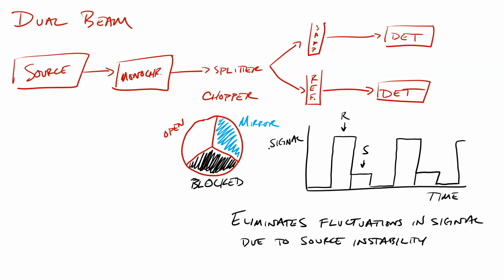Right? I'll put down here in parentheses power to remind you of that. Okay. The dual beam actually, because it has this blackout region, allows you to subtract any noise that is just in the detector. We call it sometimes black signal or dark signal.